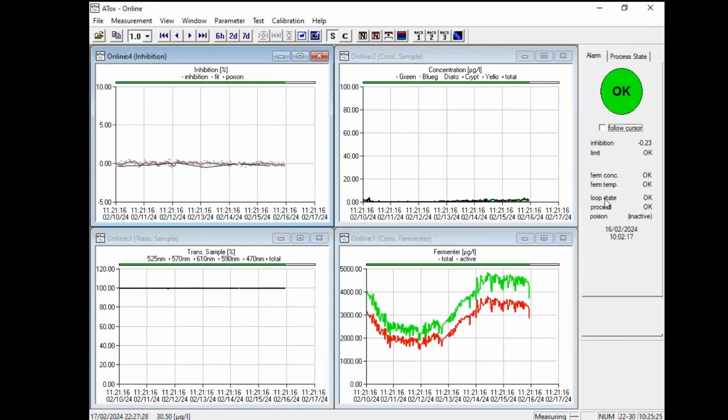I will not explain it fully, but these alarms may also turn this traffic light gray. If they are triggered, it also means that something is wrong with the process which is going on.